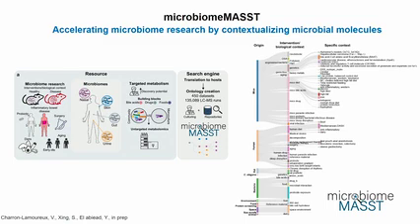They're called communities. And what we did here is to build synthetic communities. So we know which members are part of the communities. We have all the information about those microbes at the gene level, right? All these organisms have been fully sequenced, and we assemble them, and then we culture them with different types of molecules. So we have nasal, we have skin microbiome, we have gut, and then eventually we're developing one from urine. And we cultured those different synthetic communities with different building blocks.